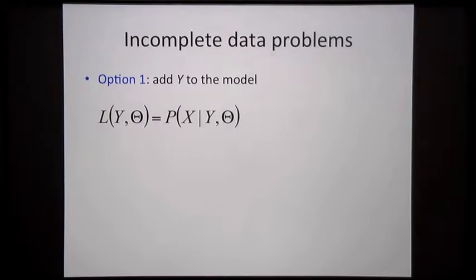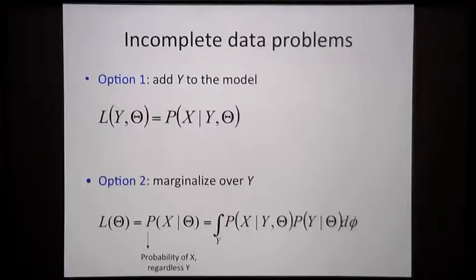Okay? So the first option, and this is the one that has been used conventionally in the field: we have our model. Think of our model as the estimate of the underlying true penguin image, okay? We just expand that model with a whole set of new parameters, and those are the orientations. So every image will get a rotation. This one is plus 45, this is plus 90, etc. Okay? And then we just have a much larger model to refine. Not only do we have to find what the underlying penguin image is, we also need to find all these orientations. That's option one.